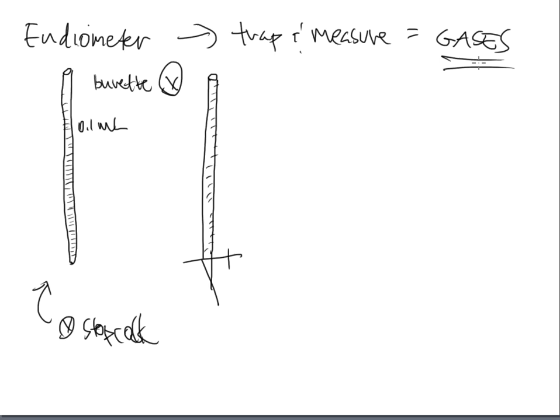At the same time, it also seems like a lot of times when these gases are introduced in lecture in a college or high school science course, they leave off the most important step, and I'll talk about what some of those important steps are a little bit later on. All right. So the eudiometer's purpose is to trap and to measure various gases that we are generating in a lab environment. All right, so let me give you an example.